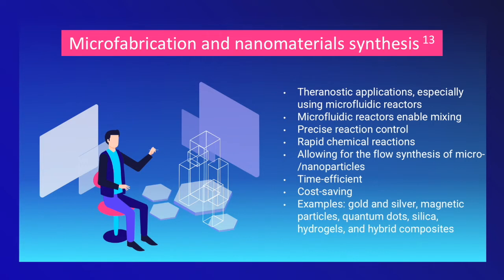they allow for the flow synthesis of micro or nanoparticles, they are time efficient, cost saving, and a lot of examples of nanomaterials can be synthesized, like gold and silver nanoparticles, magnetic nanoparticles, quantum dots, silica, hydrogels, and hybrid composites.